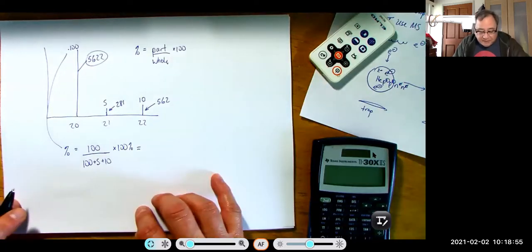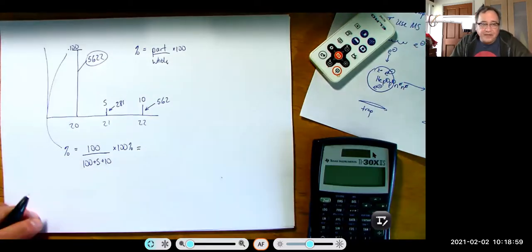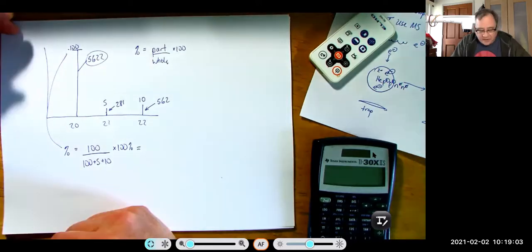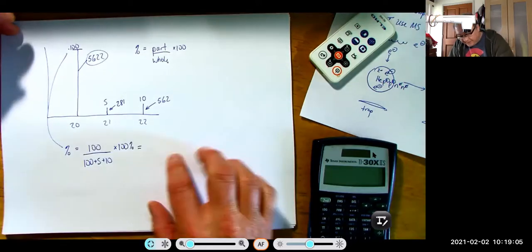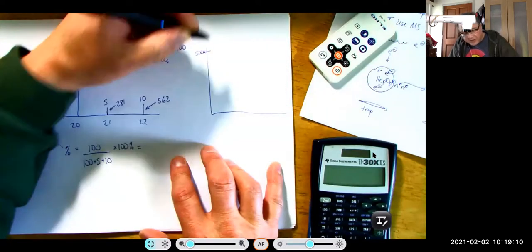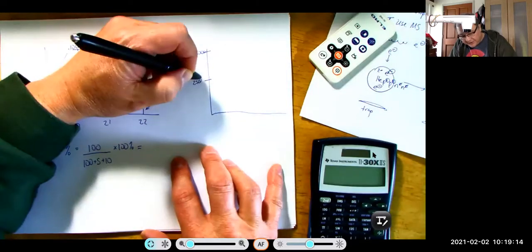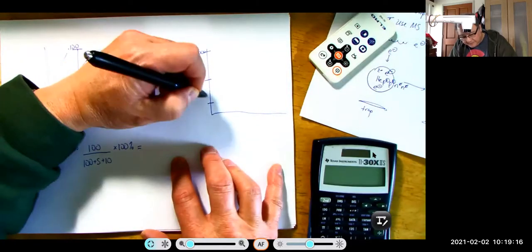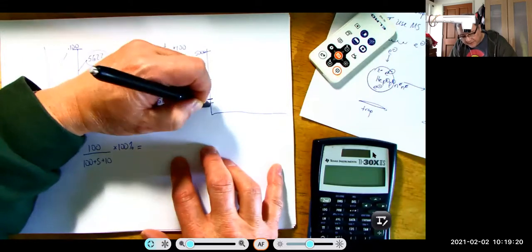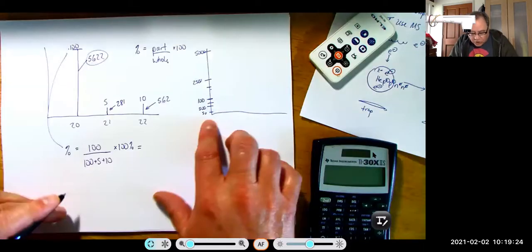So the biggest peak is automatically assigned exactly 100. And the rest are relative to that one. You see, if I drew this thing and I made this 5,000, and that's 2,500, and this is 2,000, and this is 1,000, and this is 500, and this is 50. Here's how these numbers would look over here.